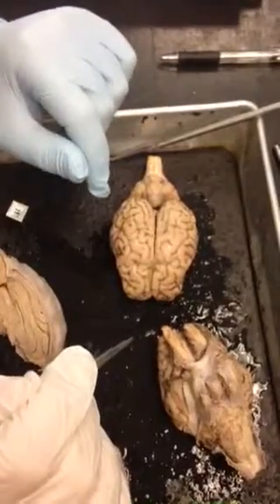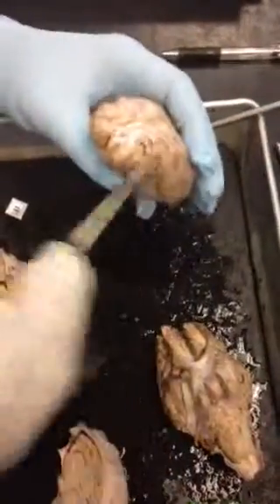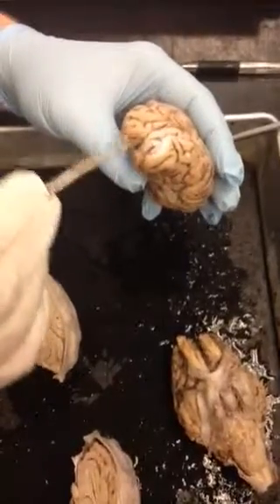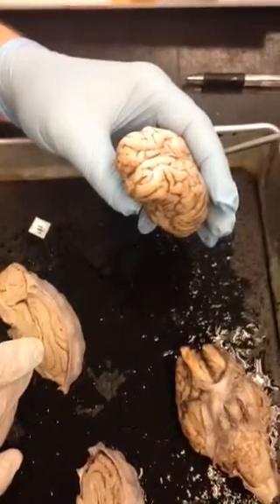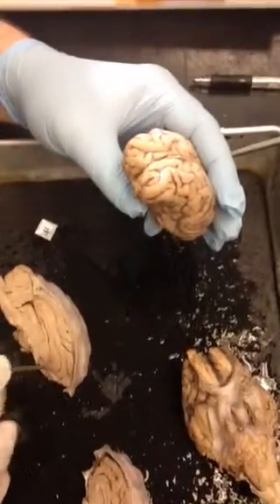Let's see what else. So that's what the functional area is. Post-central, pre-central, prefrontal cortex. So it's the frontal lobe. The prefrontal cortex is the very, very front of the frontal lobe. Right? What is the prefrontal cortex function in? Yeah, complex thinking and personality, right?